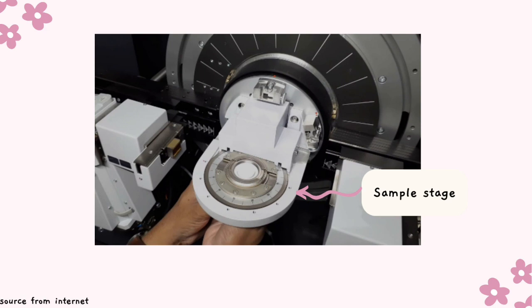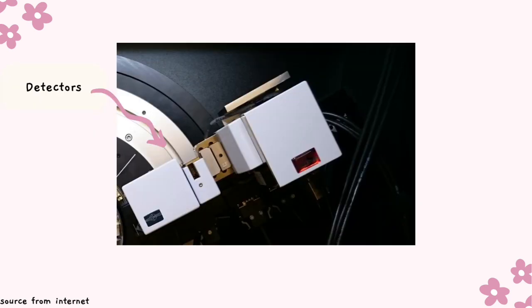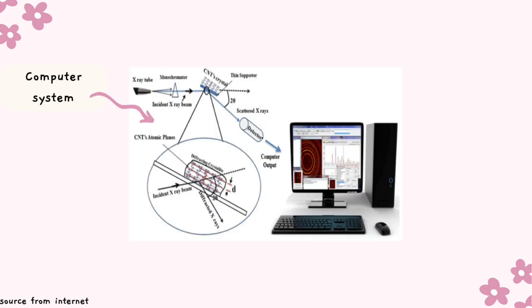The sample stage can be a simple needle that holds the crystal in place, or a glass plate, or a fiber on which the crystal is mounted using an epoxy resin. The sample is then centered with an optical arrangement such as a microscope or video camera, making adjustments along X, Y and Z directions to achieve optimum centering under the crosshairs of the viewer. With the advances in detection technology, more sensitive detector options were incorporated in advanced instruments. Lastly, the computer system will produce the X-ray pattern and results will be shown on display.